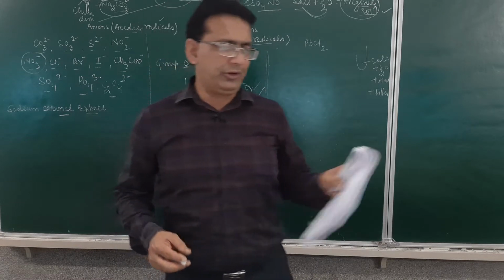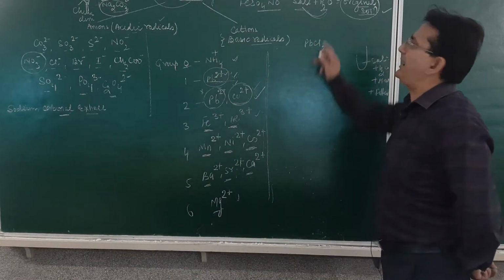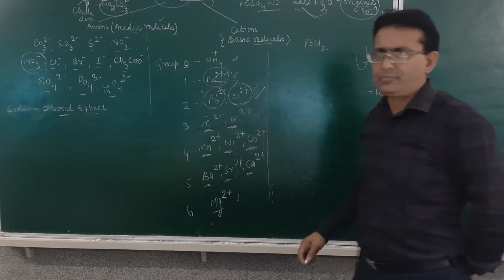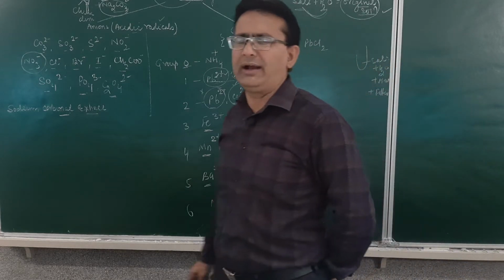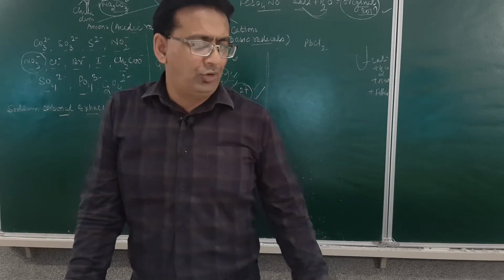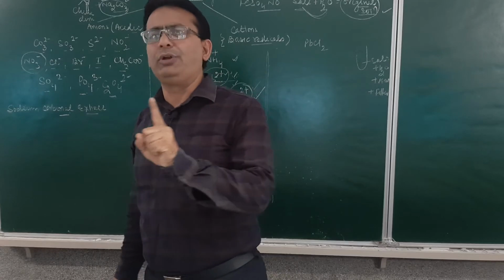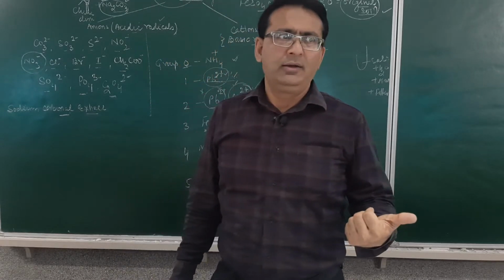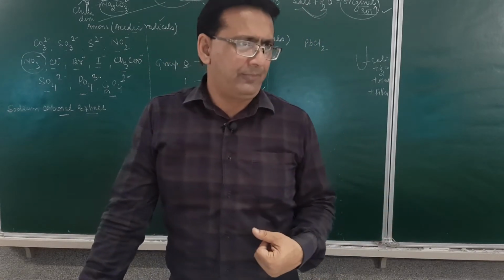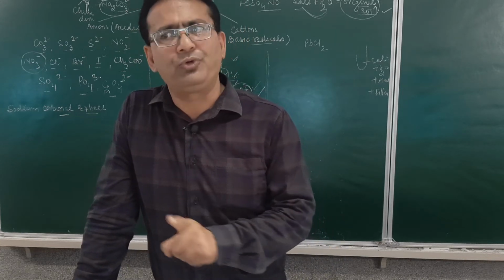Today, since you are doing it for the first time, I have given to you a nitrate anion. I will be demonstrating to you how we identify the nitrate anion also. Am I getting clear? So out of all these, today I am telling you which salt is being given to you. In the future, whenever you come next to the lab, the salt will not be told to you. You yourself have to identify it.